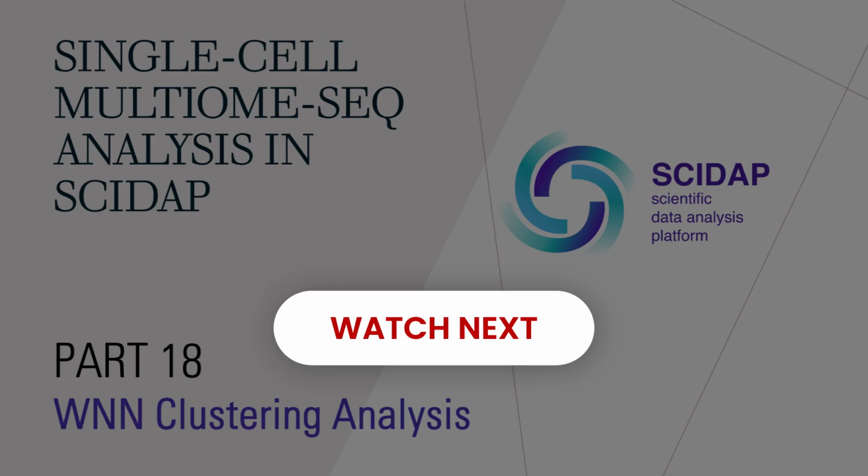WNN clustering. In that step we will combine signals from both ATAC and RNA together using weighted nearest neighbor method.